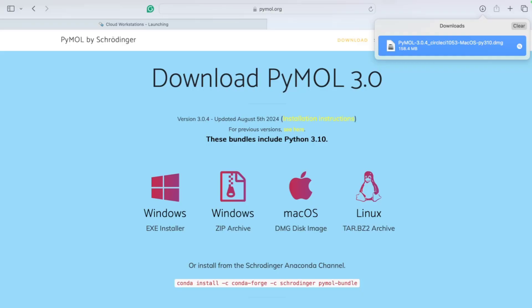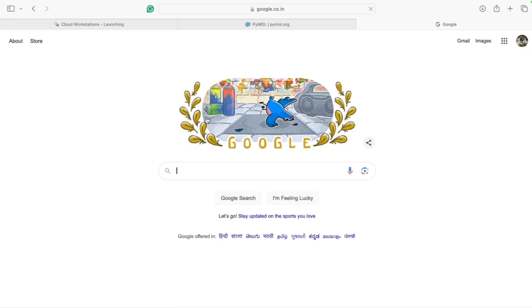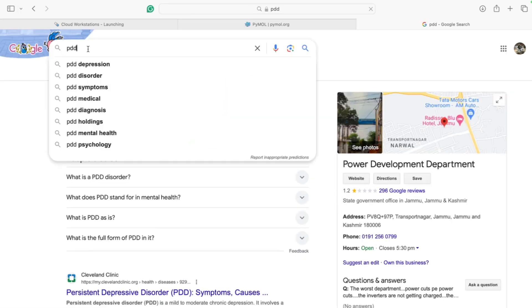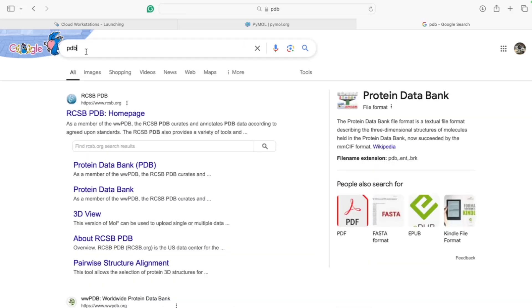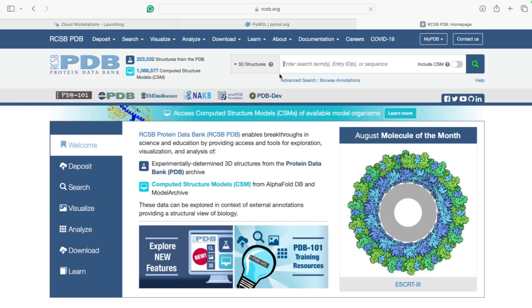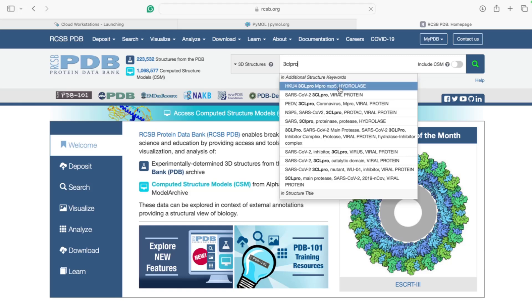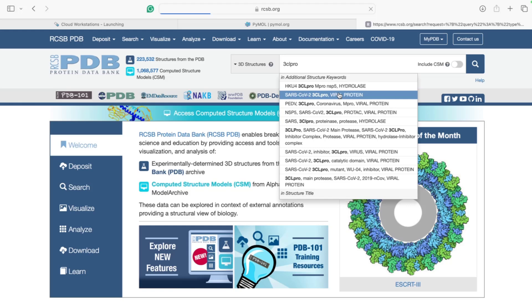To demonstrate the interface, let's download a file. We can visualize 3D structures such as protein-ligand interactions. Let's go to the PDB — the Protein Data Bank. I'll search for 3CLpro, which is the main COVID-19 protease, also called Mpro.